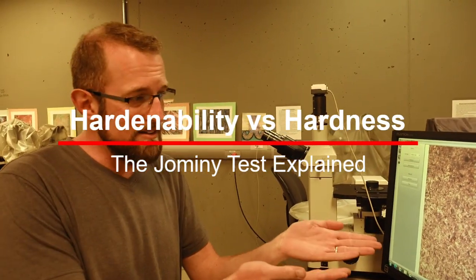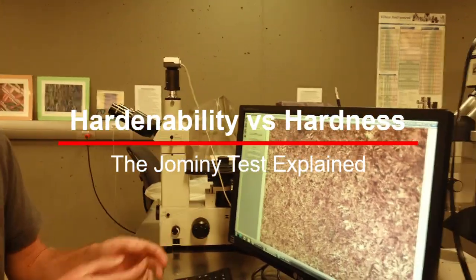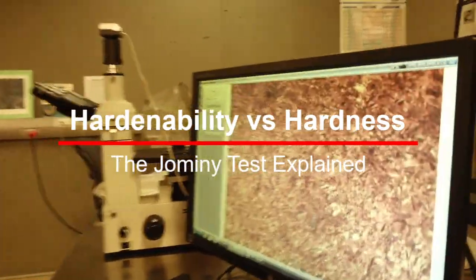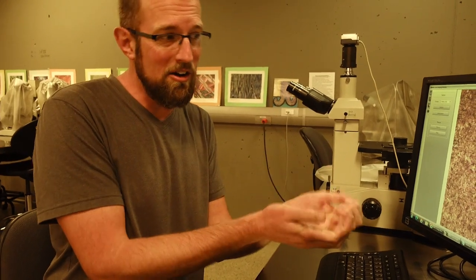That's because it's actually forming these crystals, these grains, in a microstructure that we call martensite. You can see all the cool little needles throughout there making these very fine grains from the quenching process that cools so quickly that any carbon in the steel ends up getting totally trapped.